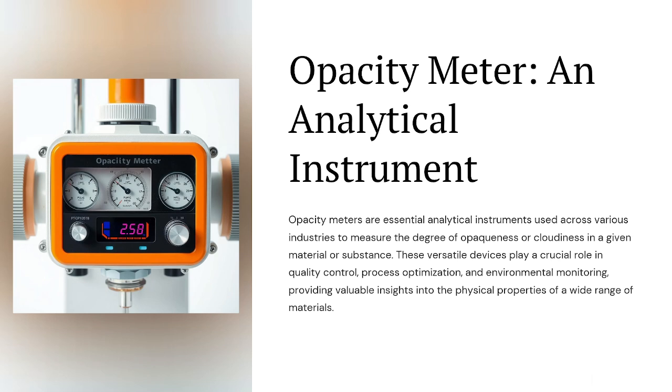Opacity meters are essential analytical equipment used across various industries to measure the degree of opaqueness or cloudiness in a given material or substance. These versatile devices play a crucial role in quality control, process optimization, and environmental monitoring, providing valuable insights into the physical properties of a wide range of materials.